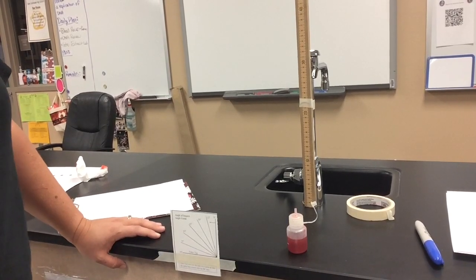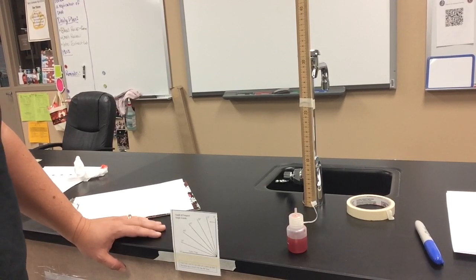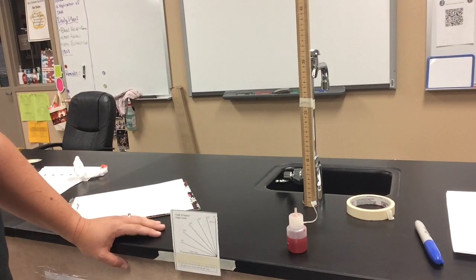So part 3 for your Bloodstain Science Lab is to take a look at how the angle of the drop as it hits a surface affects what it looks like, its length, its width, etc. And then we'll talk about how to calculate an angle of impact from these drops once we get them.